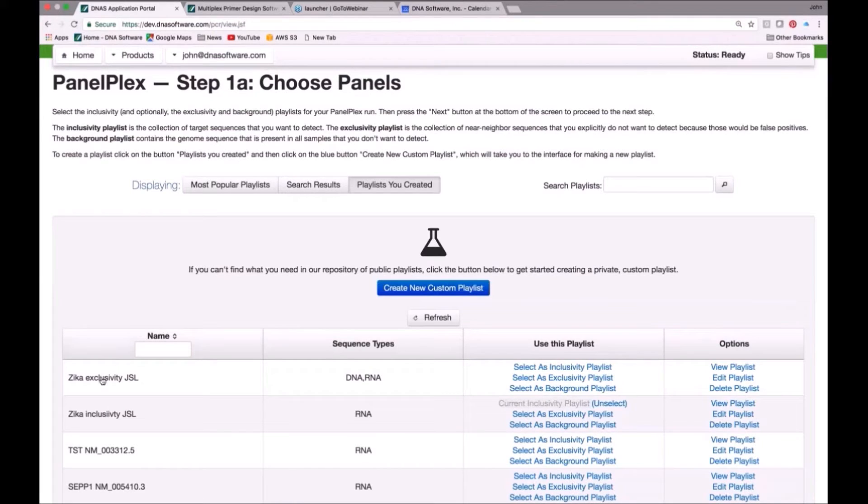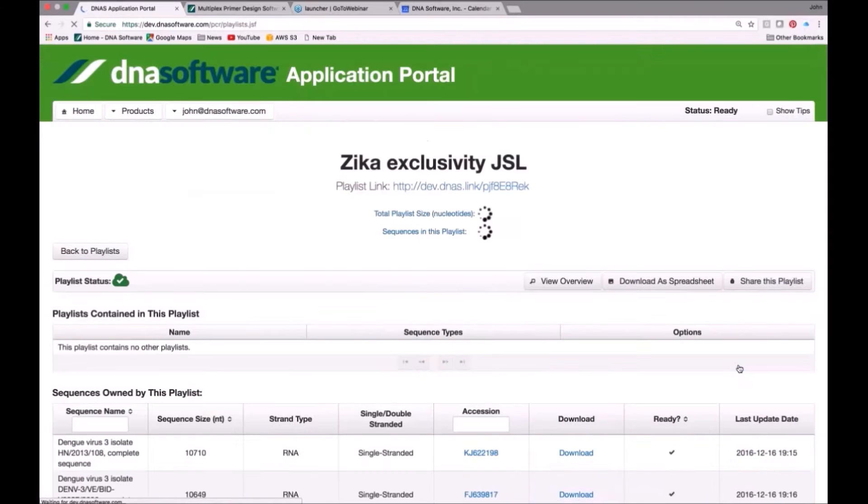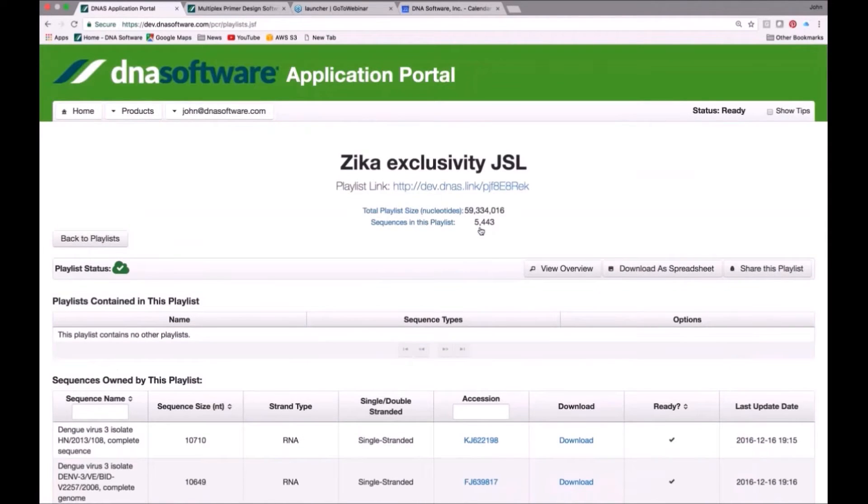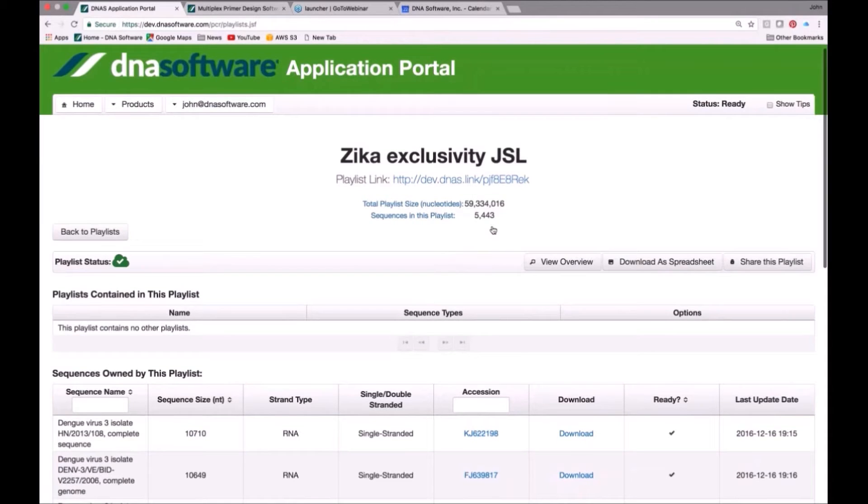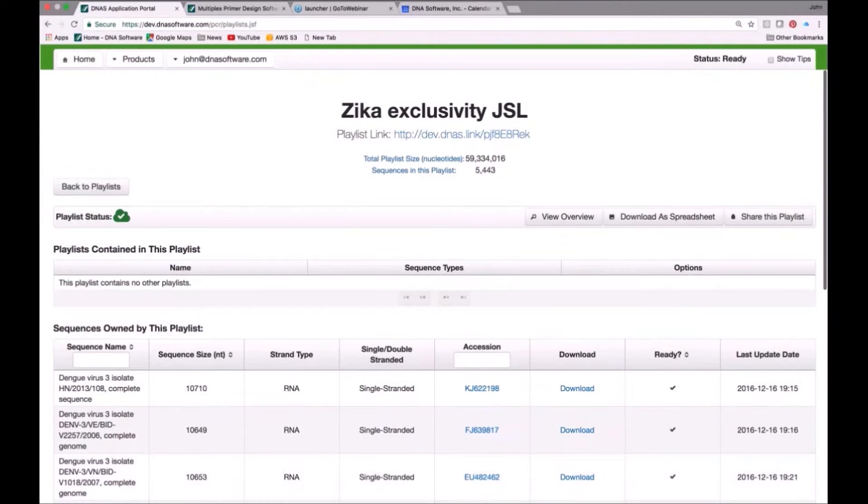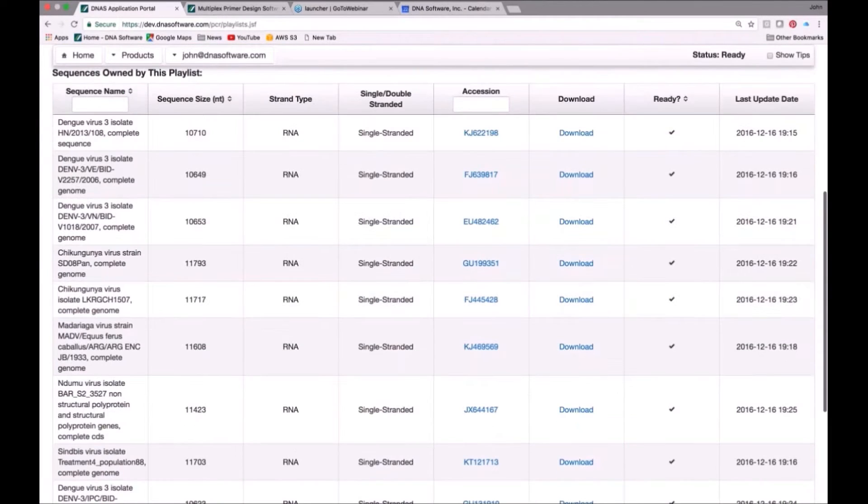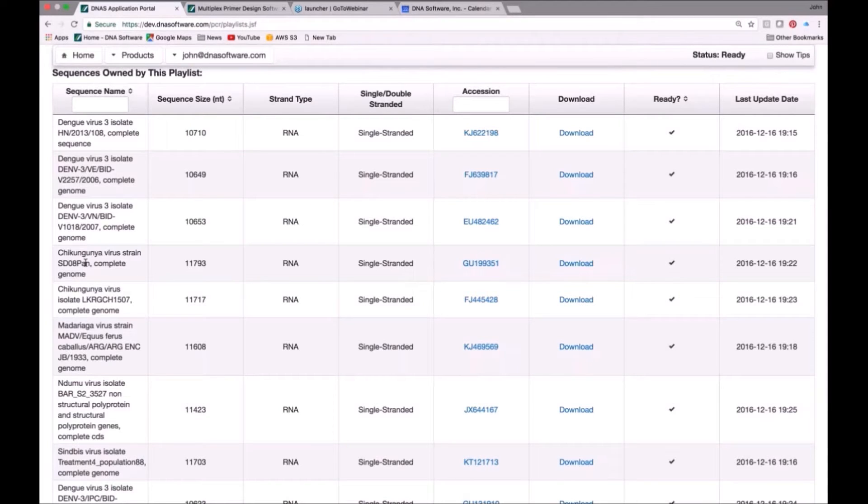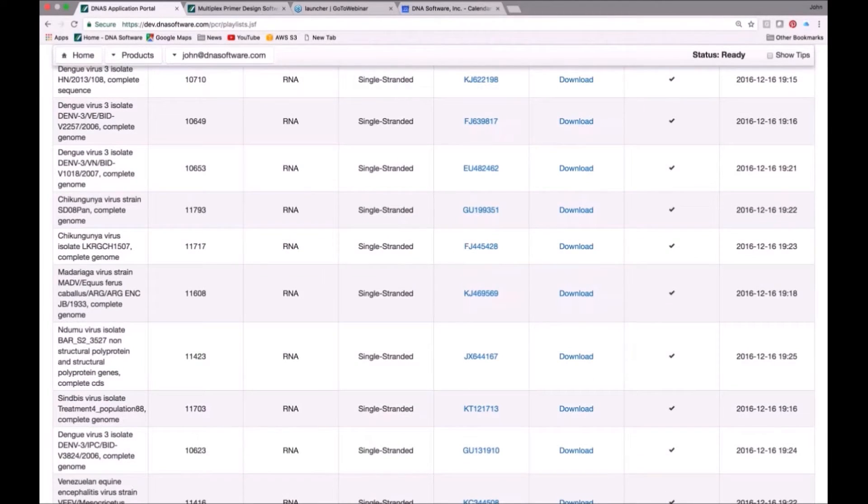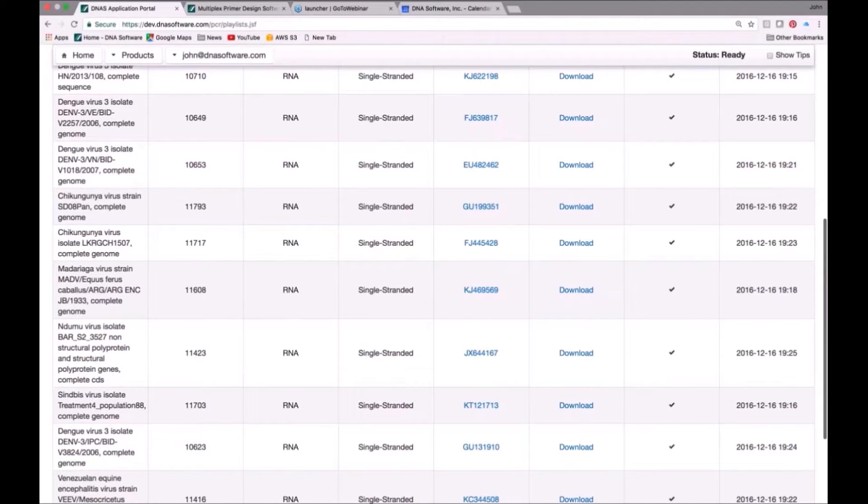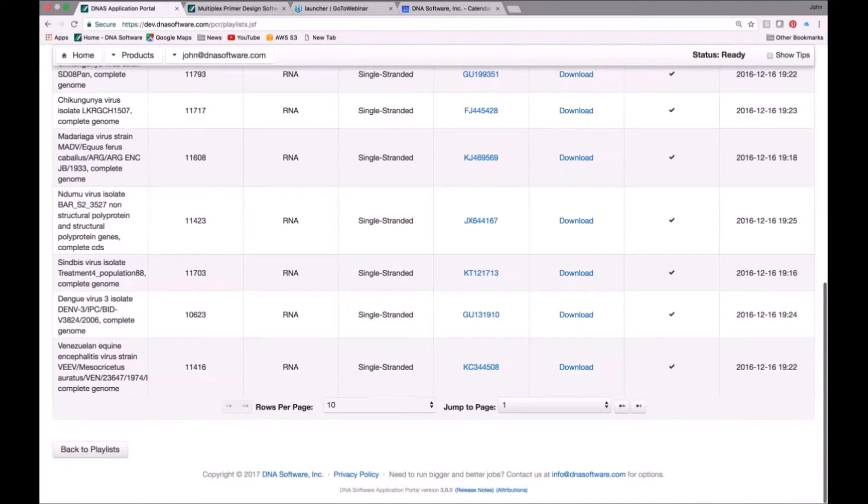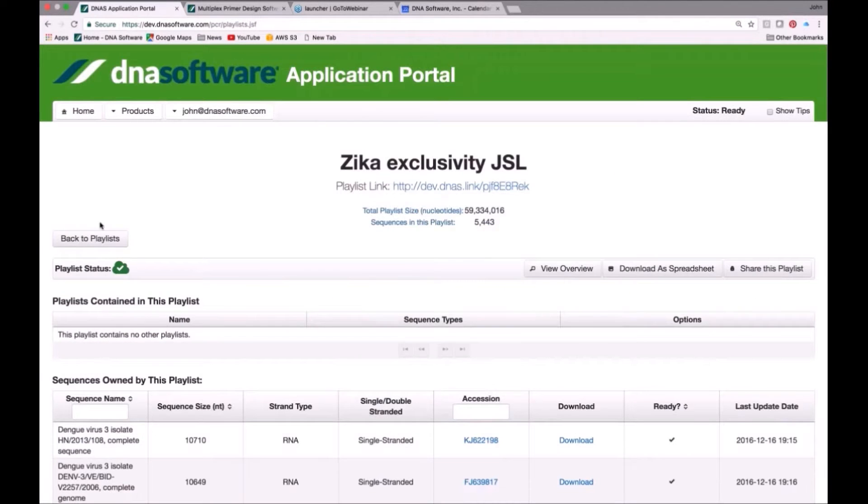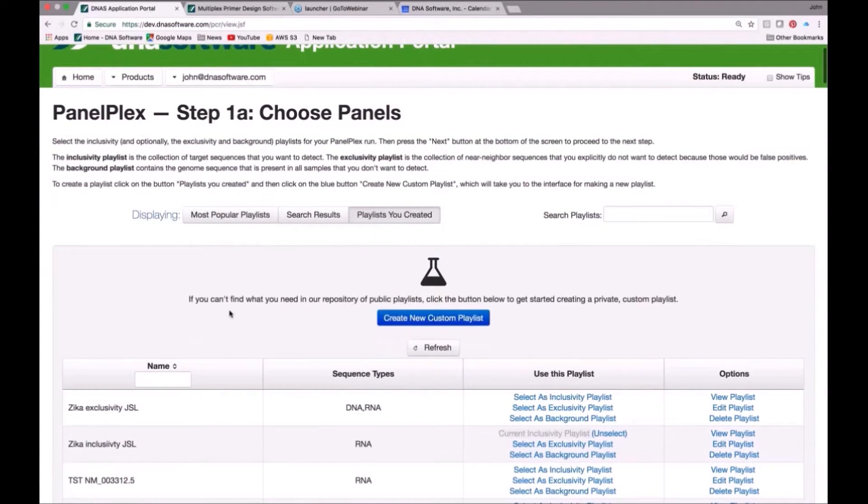Now we have the exclusivity playlist. I've already prepared this exclusivity playlist for Zika. Let's go ahead and view that one just to give you a sense. This Zika playlist has 5,443 near-neighbors, other flaviviruses and fever-causing viruses that are somewhat related to Zika virus that we want to make sure don't cause false positives. For example, we can see some examples of dengue fever virus, chikungunya, which is actually not so related, it's a togavirus, but it's still a fever-causing virus, and several other viruses that you can see here on this list that are related to Zika virus that we would not want to cause a false positive. That has been pre-done, so I just choose that as the exclusivity playlist.